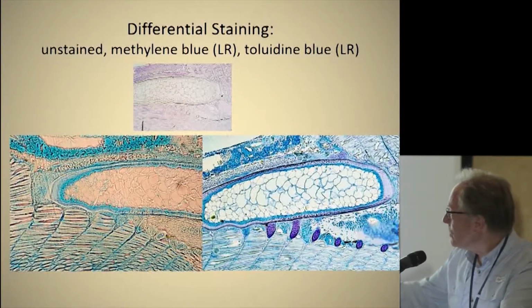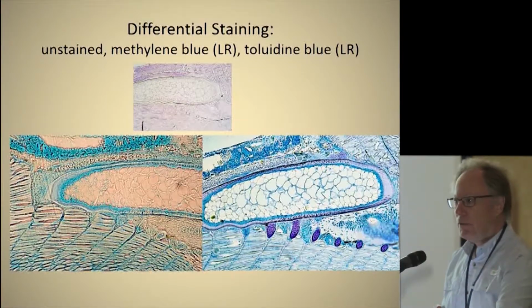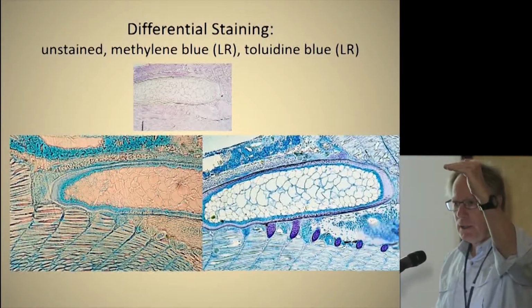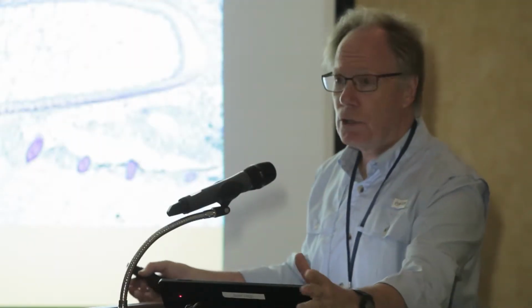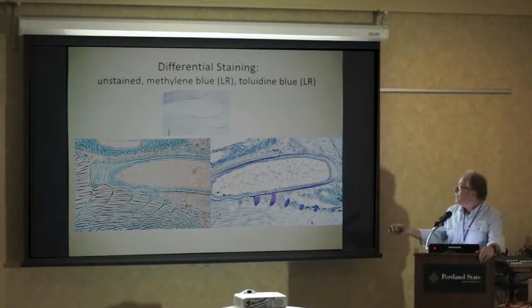And it stains the tissues, but it doesn't stain the media that is around there, the embedding media. But again, all it does is bond to protein lipid, and everything is protein lipid, and it really doesn't make a distinction based on the density of the protein or the thickness of the lipid layer. It just shows you what is there. So I can point out to them notochord. Yes, you found the notochord. You also have muscles here, but it doesn't really show you much.